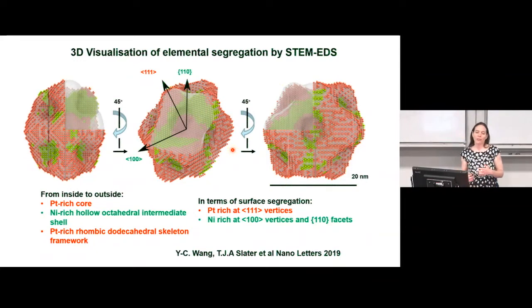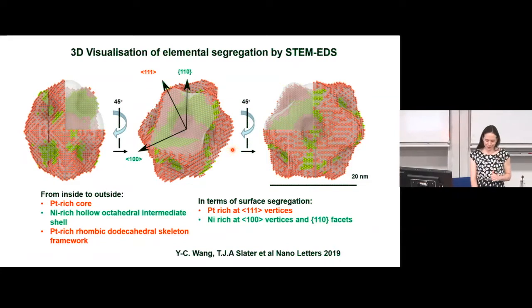And if we do that with an X-ray map, that EDX mapping, you can then create an elemental map in 3D. But whereas X-ray maps tend to be at the tens or hundreds of nanometer scale resolution, the elemental maps that you can get using scanning transmission electron microscopy tomography can be right down to the atomic scale. Okay, so that's kind of an advert for a different talk.